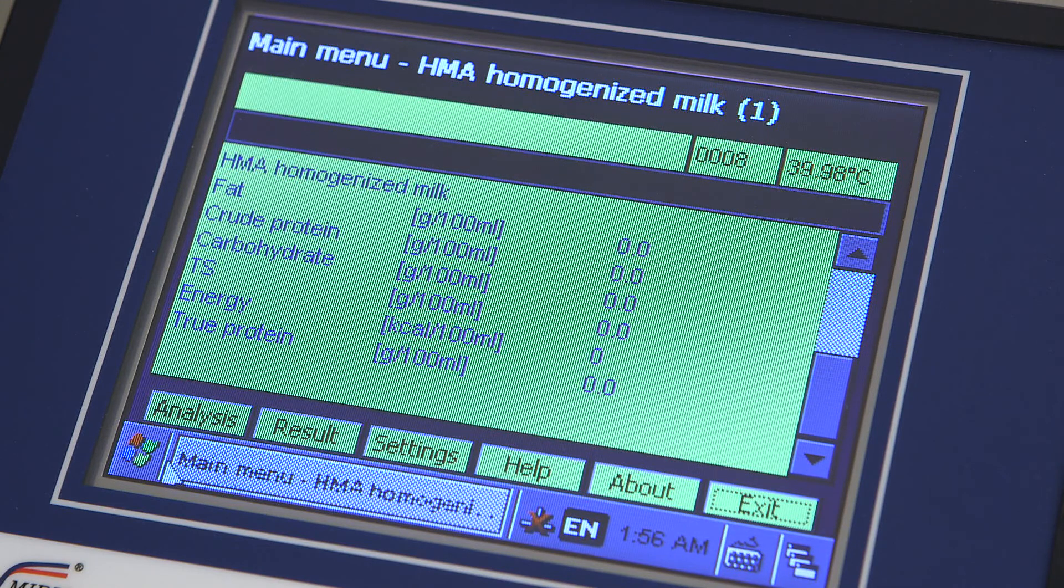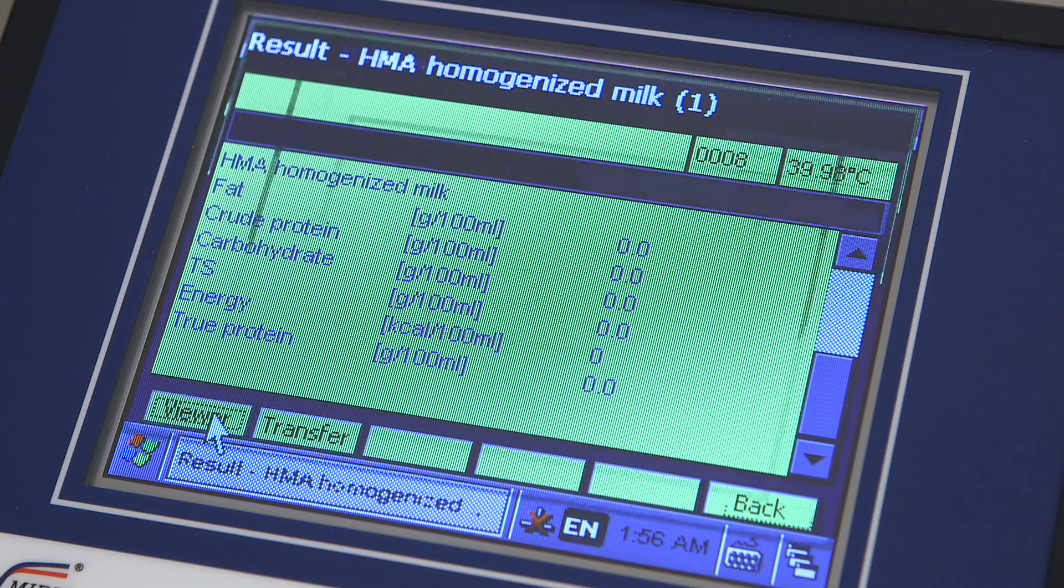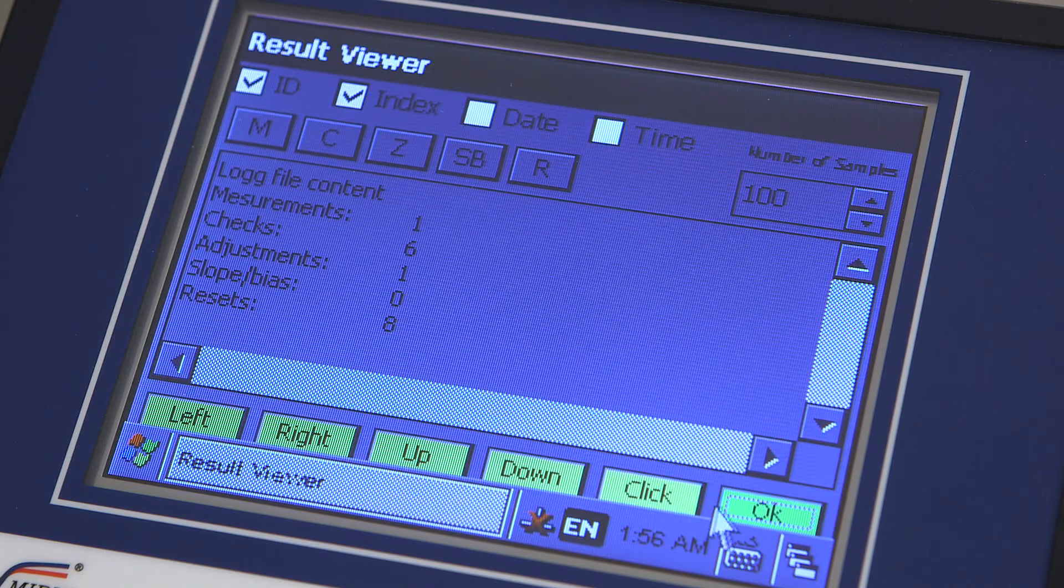Previous results can be simply viewed on screen by selecting Result on the menu bar and then Viewer. To exit the menu, press OK.